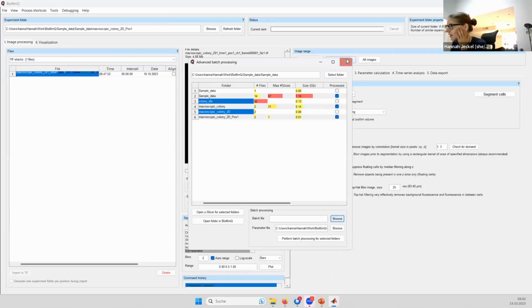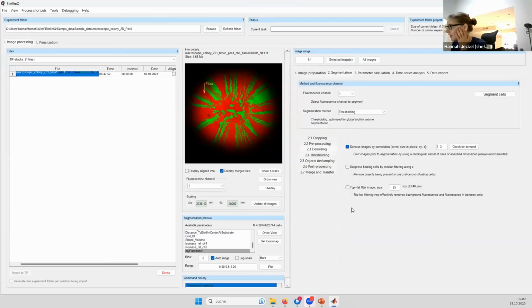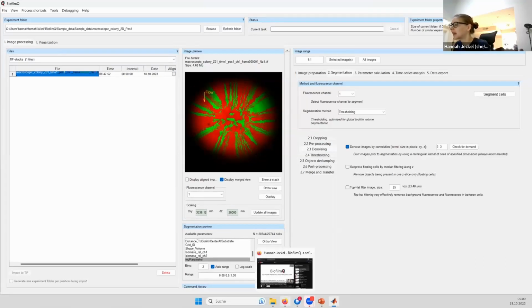So yeah, this actually means that we're perfectly out of time. I am anyways going to stay here for questions though. I think I went through pretty much everything that I wanted to show you. I hope that you learned something new. And I hope that you will keep working with BiofilmQ and keep connecting with us through the forum, because that is the one place where you have the best chances of us answering, because it's public, so we want to answer it. Now, we also answer email.